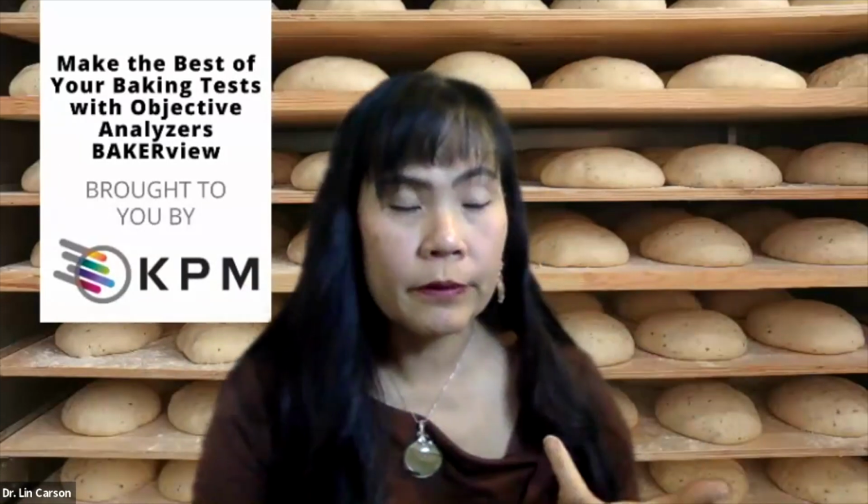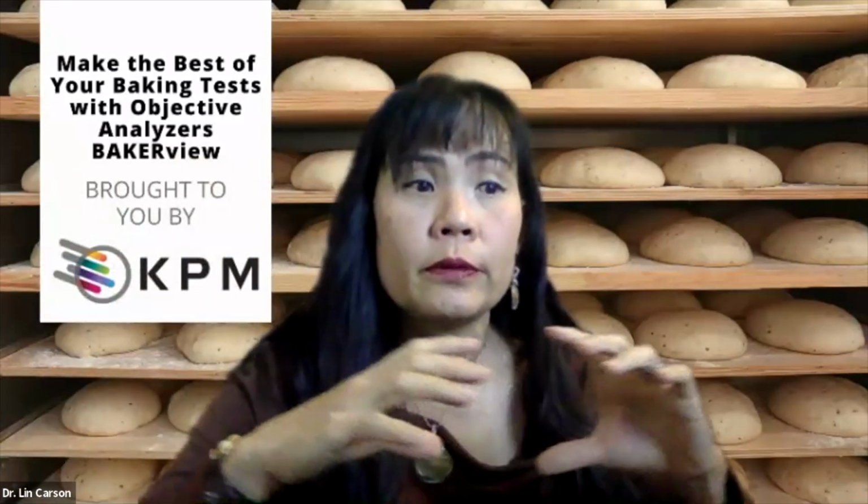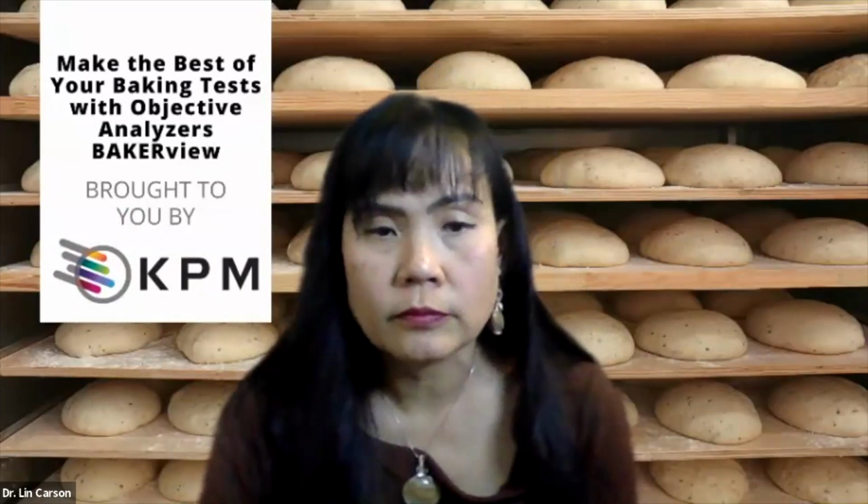So if you have the capability to quantify each and every step and to make sure that you're mixing properly, proofing properly, and baking properly, you should be able to use what Lena recommended for objectively quantifying your process. Yeah, no, absolutely. This is the example that you said is perfect to control your mixing time. You test your formulation with different mixing times, and then you place the dough into the RheoF4, and you see which is the optimal in order to have the best dough development, maximum dough development. Correct.